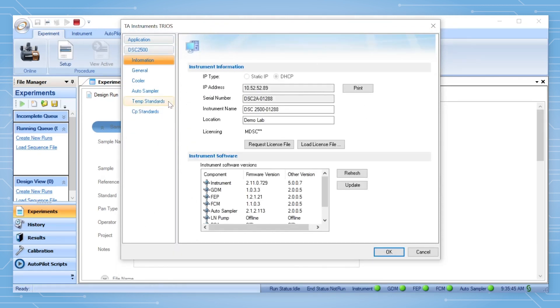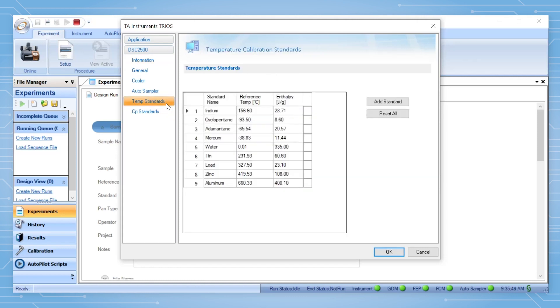Click on either temperature or CP standards, depending upon what the standard will be used for.